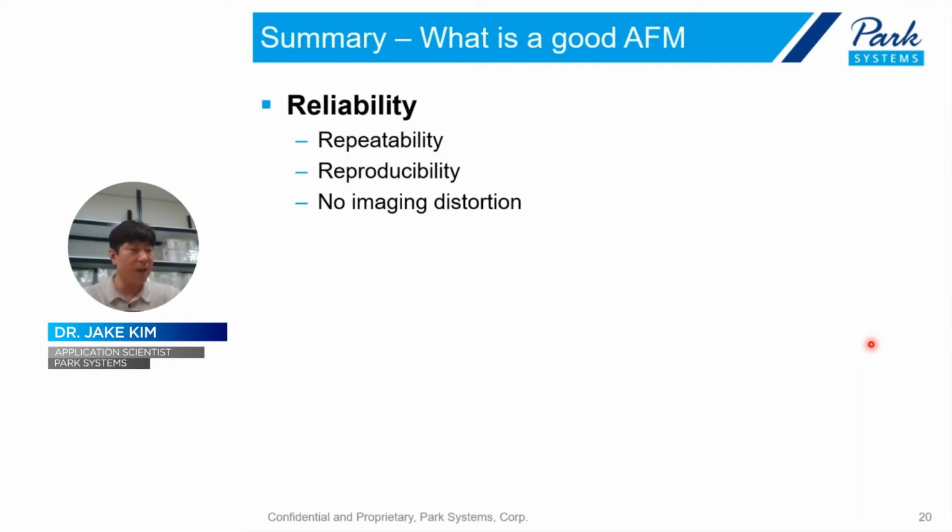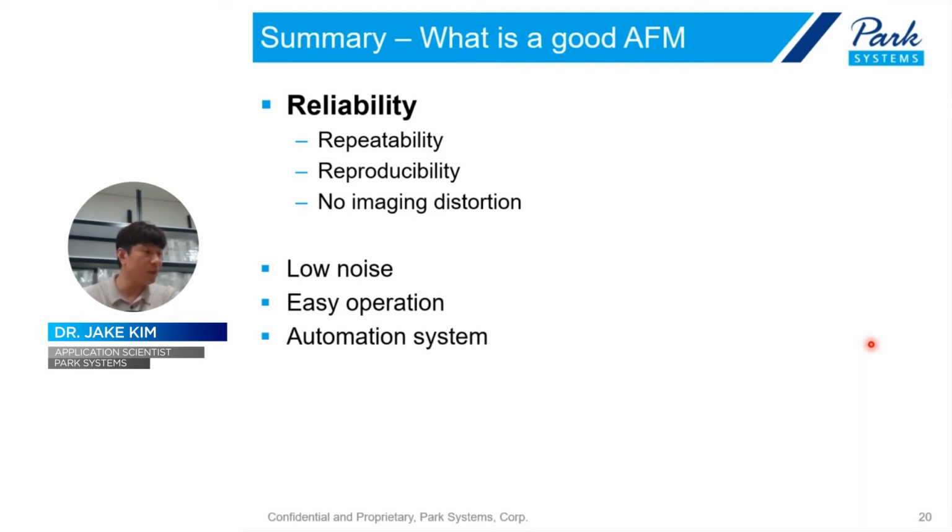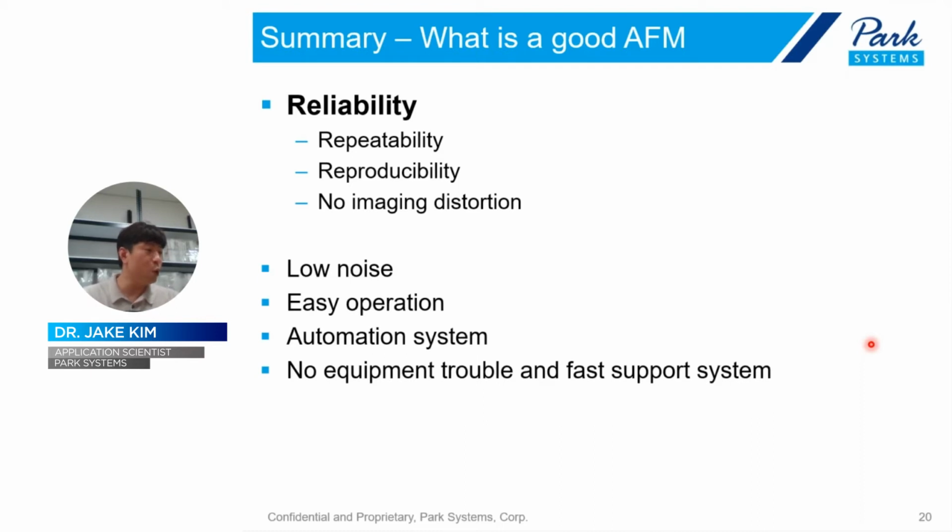And additionally, to be a good AFM, we should have a low noise level, easy operation, an automation system, and of course, no equipment trouble and a fast supporting system. A fast supporting system is required.